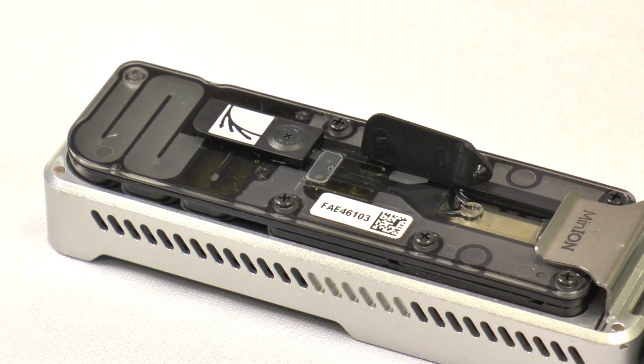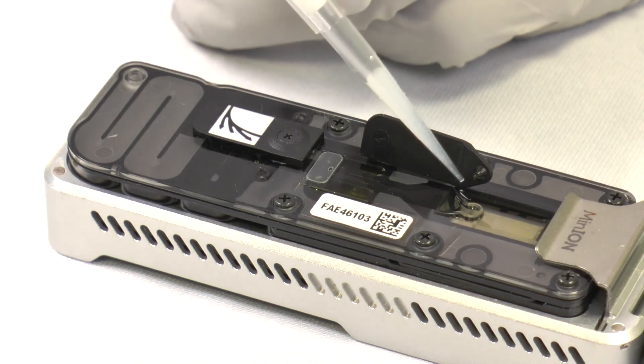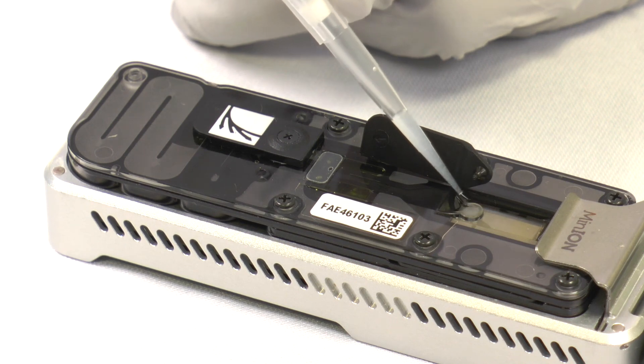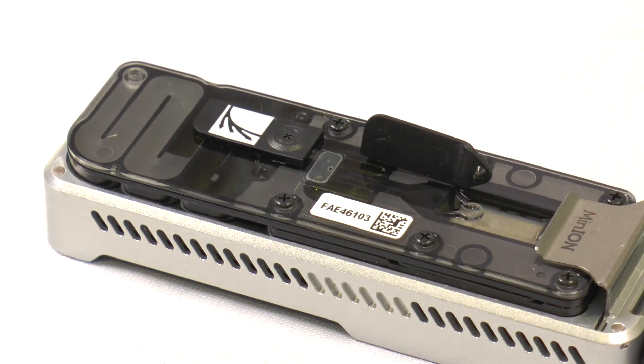The library needs to be loaded onto the flow cell immediately after the second flush. When you're ready to load the library, use a P200 pipette to add the library drop-wise onto the spot-on port. Ensure the tip only hovers above the port and does not come into contact with it, as the spot-on port sits directly above the array and we don't want to damage the array or introduce any air bubbles into the system.